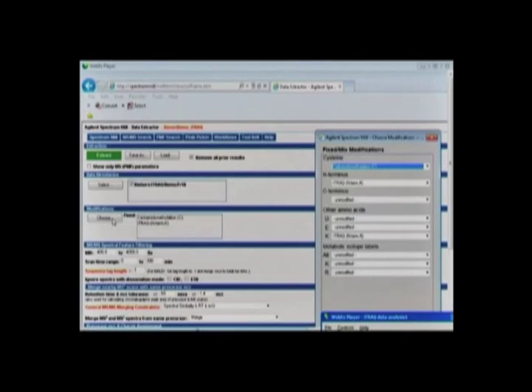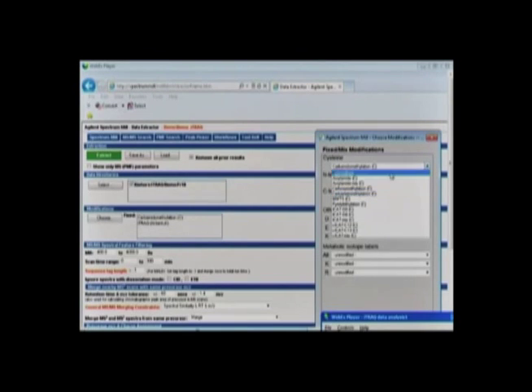As we are analyzing the iTRAQ data, before extracting the MS/MS data, we need to assign the modifications on the peptide: carbamidomethylation on cysteine and iTRAQ label on the N-terminal amino acid and lysine.